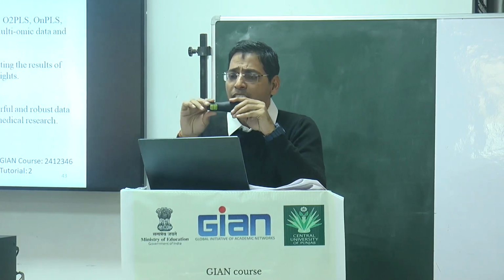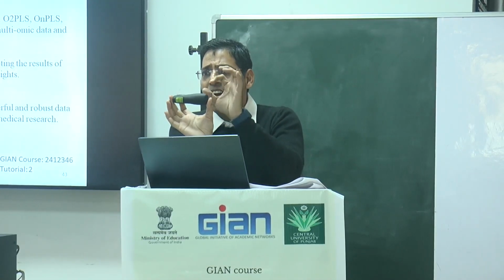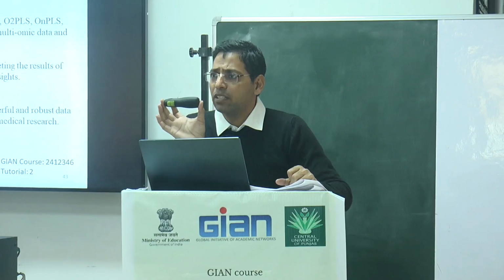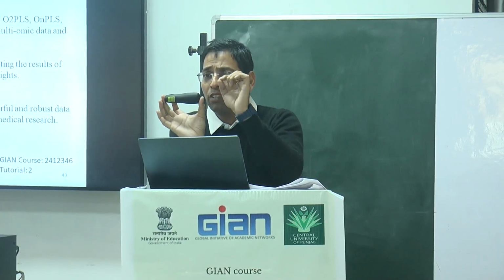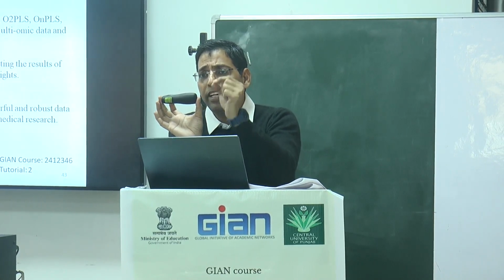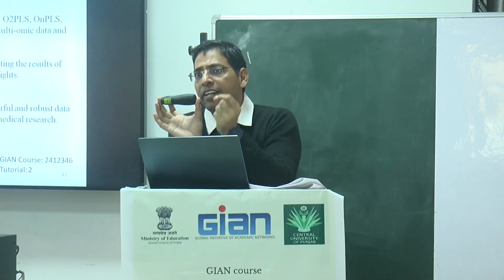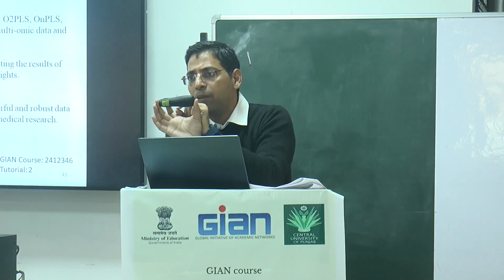Now this column, you think this is a small one. Every column, we divide into theoretical partitioning plates actually. Every analyte of your interest interacts with one theoretical plate, then it comes out, then it goes into another theoretical plate, then comes out, then goes into another.